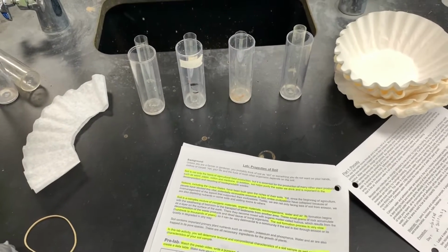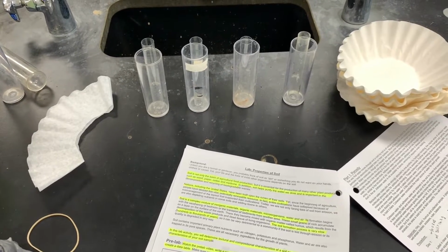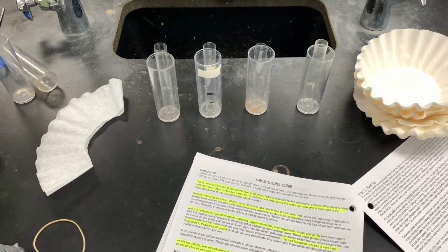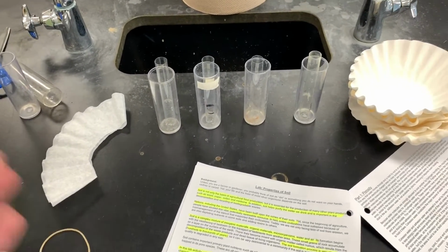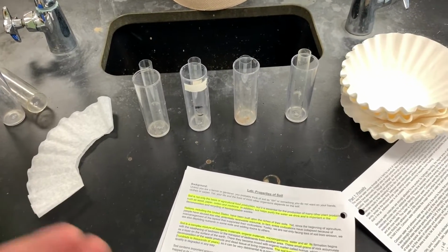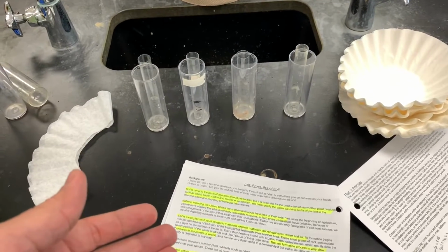Basically, the purpose here is to show that different parts of soil can absorb water differently, and then obviously a combination. Your soil is never going to be all of one thing. So it's never going to be all clay or all sand, unless you're planting on the beach, or all silt.